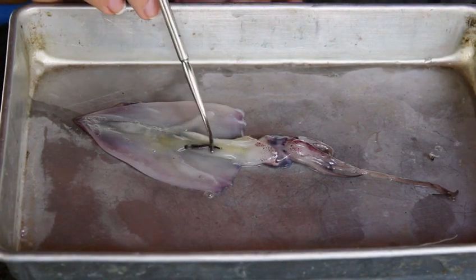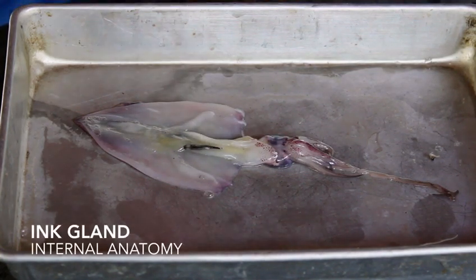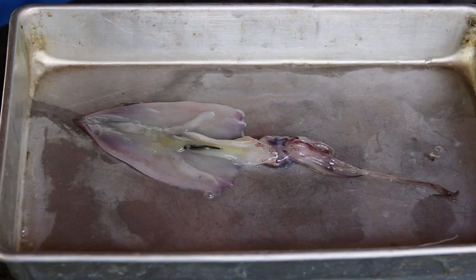This is their ink gland. They use this mostly for protection — they can release their ink and it will release a pseudo-image of the squid, mostly used to confuse predators.